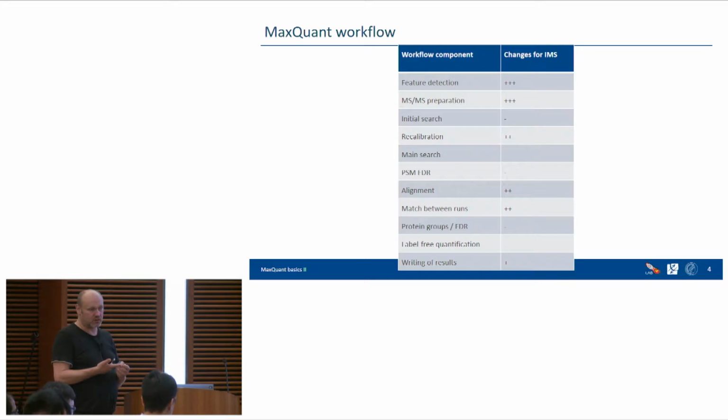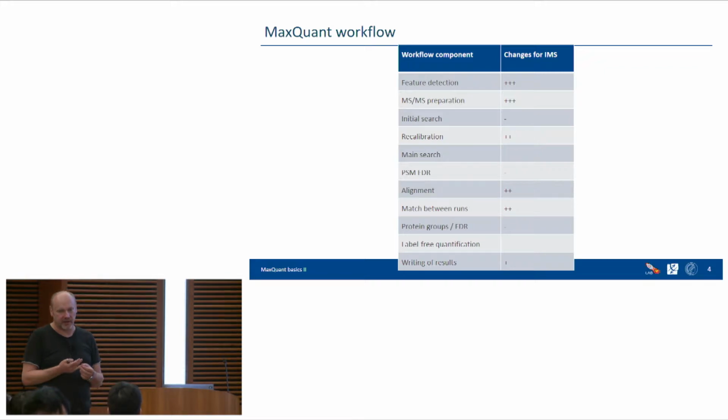And so now the question is, will this also have to depend on the ion mobility index, right? And the answer is actually yes. So we also will have to take into account an ion mobility dependent correction of the mass. And since this is TOF data, we also have to take into account an intensity dependent correction of the mass. So basically two more dimensions are added on which the calibration function will depend, right? So recalibration also needs quite some adaptation.